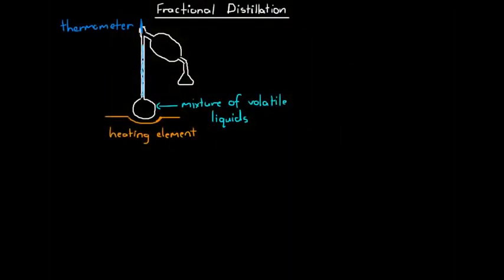So what we're going to look at here is the process called fractional distillation. Fractional distillation is all about allowing us to separate different liquids. So when we're dealing with lots and lots of, for example, alkanes, if we've got a mixture containing methane, ethane, propane, butane, and so on, and we want to separate those, then that can be very hard because these are all very chemically similar substances. However, fractional distillation allows us to actually extract the individual alkane out of that mixture that we are after.